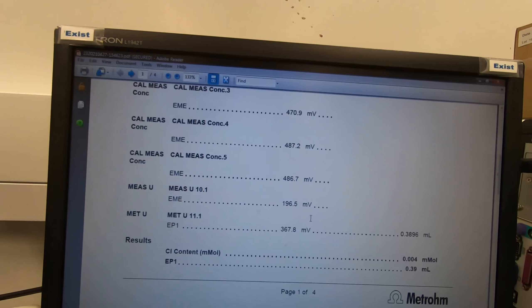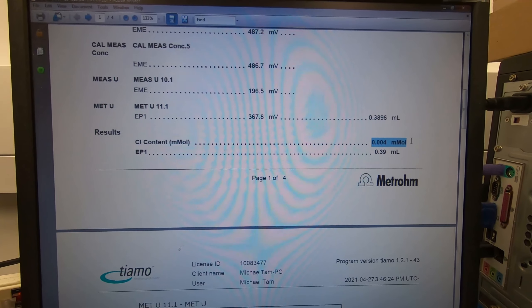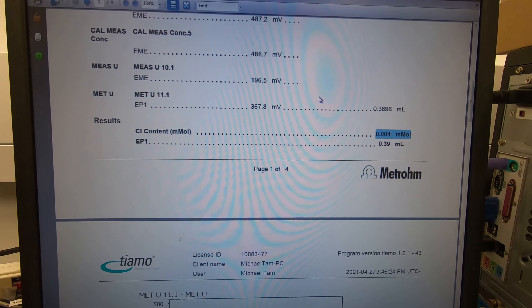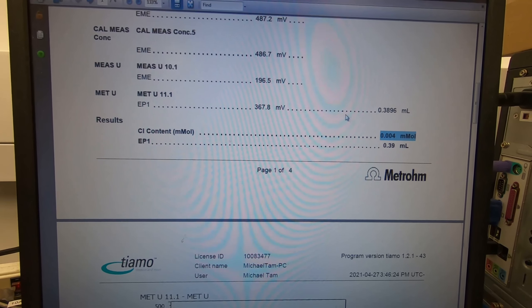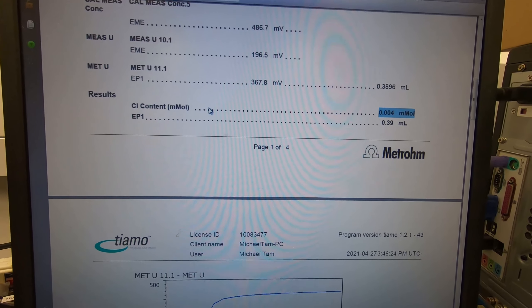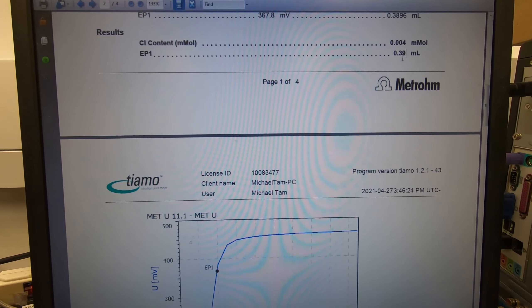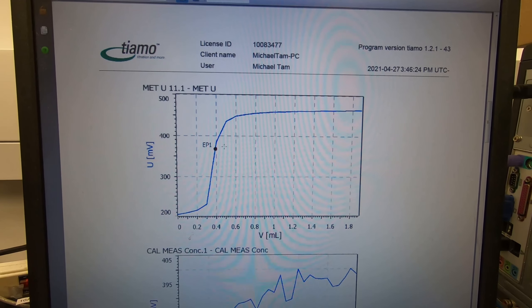It will show the calibration ranges and it will also automatically calculate how much chlorine content is present - although it may not always be accurate. The question was how do we know the chlorine content. Bromine works the same way. This is the end point, so you don't need a very small volume - it's only 0.39 ml because of the concentration of the samples.